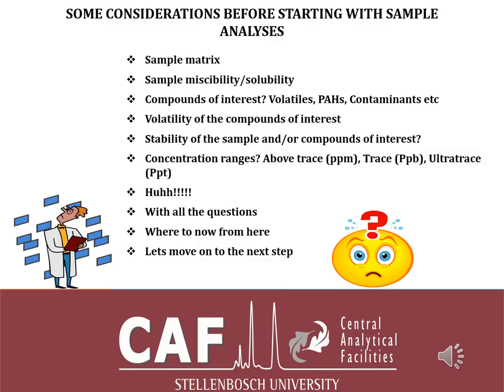So spend a little bit of time with the client discussing what they want, and also what their explanation of the contaminant is. I've heard in the past, when people talk of trichloroanisole, they'll tell you, for instance, that the wine is corked. If the wine is corked, it can mean a lot of things. It does not necessarily mean it's trichloroanisole. It could be that there's some TDN, or you've got maybe vitispirane in there, which gives a corked smell in the wine, but people think it is trichloroanisole.